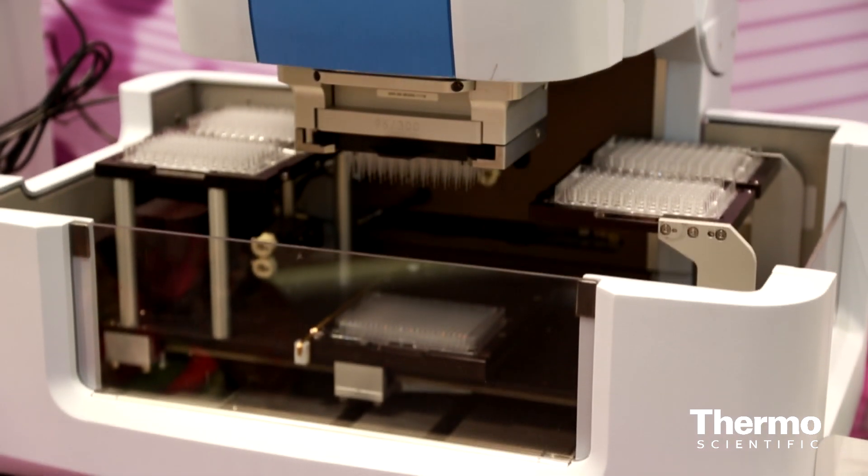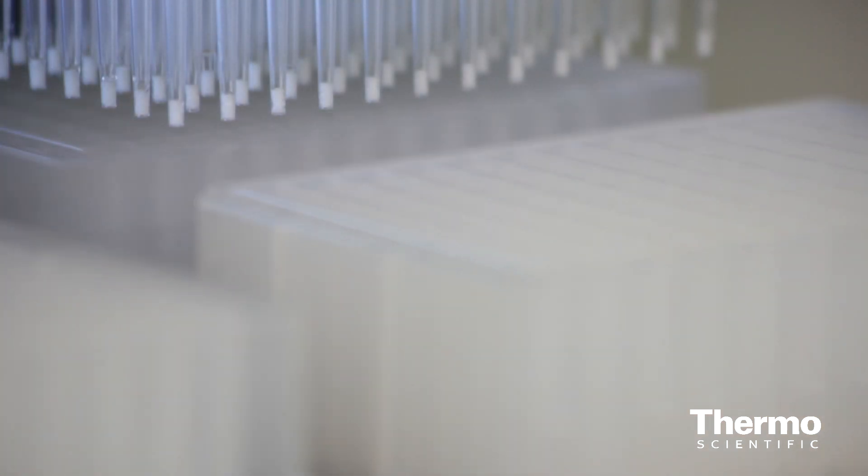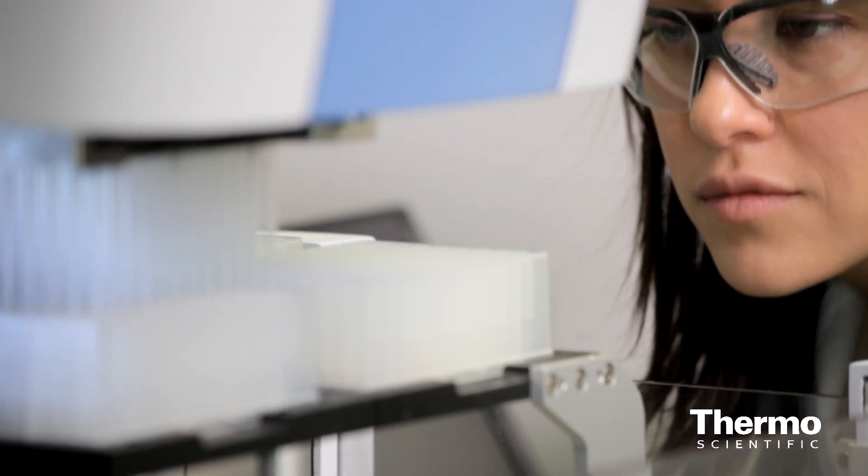Once you're ready for a high-throughput methodology and you want to look at a lot of samples at once, you can do a 96-sample format in our Verset Automated Liquid Handler. Really easy to use, compact bench space, and good software to do your MESA experiment.